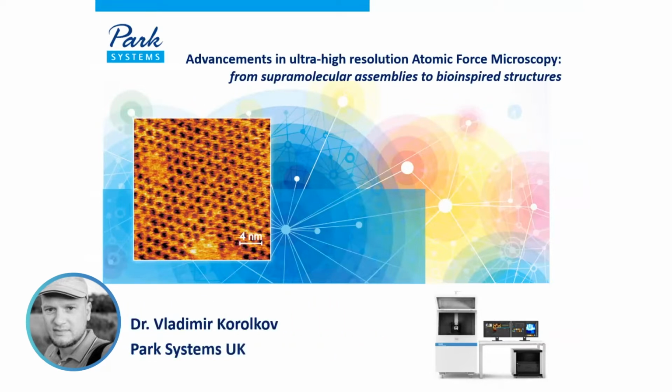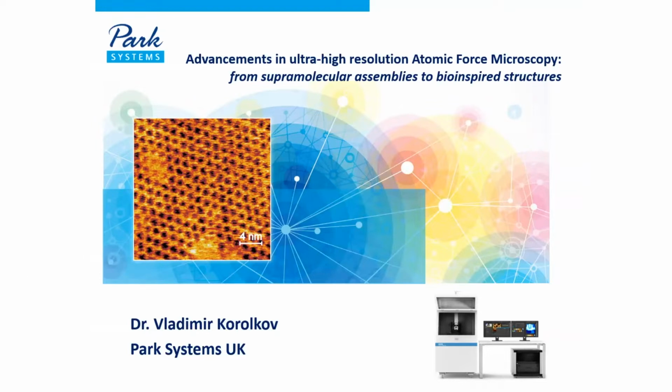I hope you enjoy Simone's talk as much as I did, and he probably saved me a little bit of time trying to convince you that atomic force microscopy is actually a quite powerful technique in unveiling the structure and properties at extremely low scale. So in this talk today, I would like to show some recent advancements in ultra-high resolution atomic force microscopy that could be achieved on the ambient atomic force microscopes.